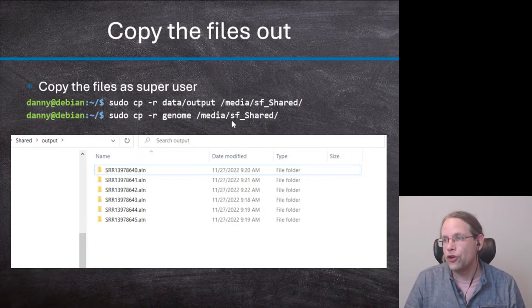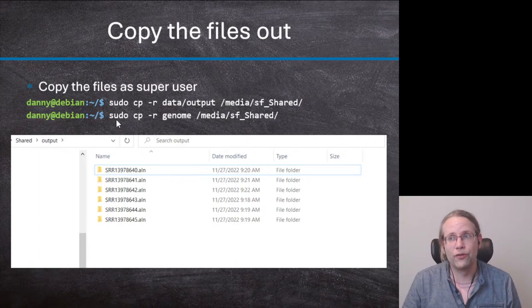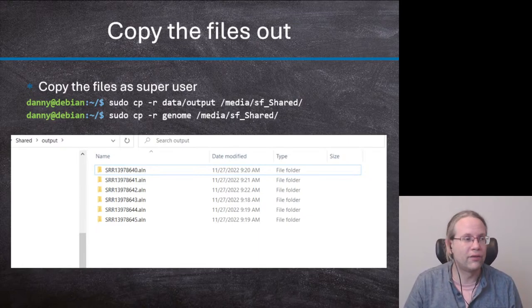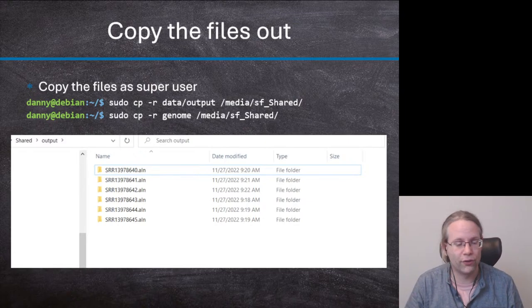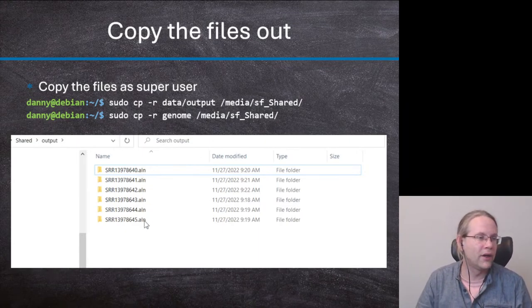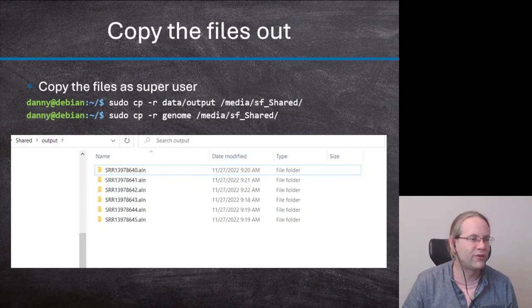Good. So just copy them over and then close the VirtualBox. And once the VirtualBox is closed, we're not going to use it again because it is relatively slow. So for the rest of the lecture, or the rest of the live stream, I'm going to assume that you've been able to align the files using the pipeline. So happy to follow the video.